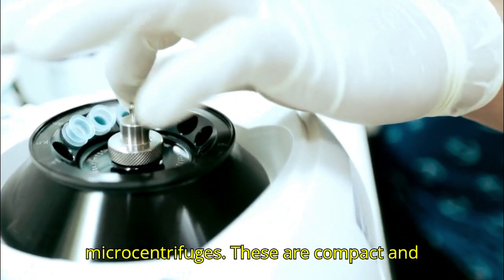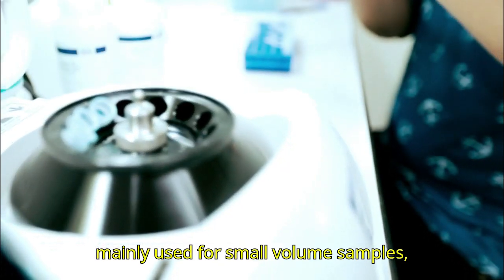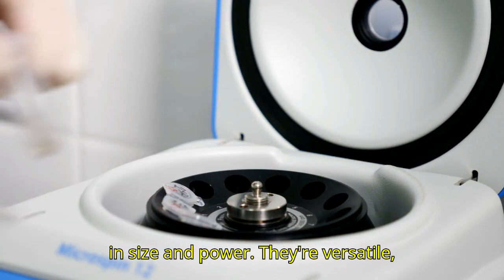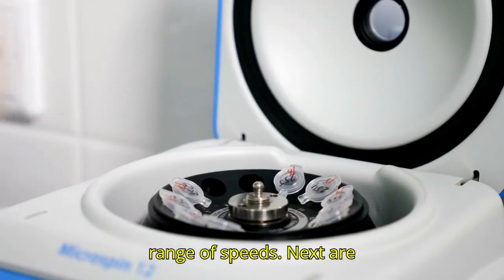Starting with microcentrifuges, these are compact and mainly used for small volume samples, typically in molecular biology labs. Then, we have benchtop centrifuges, a step up in size and power. They're versatile, handling larger samples and offering a range of speeds.